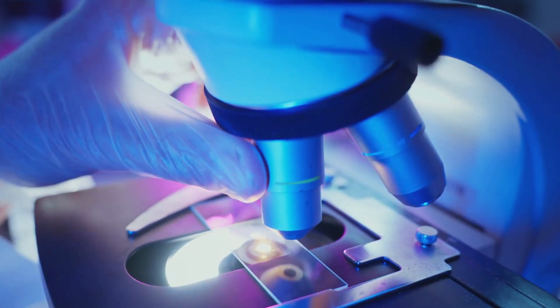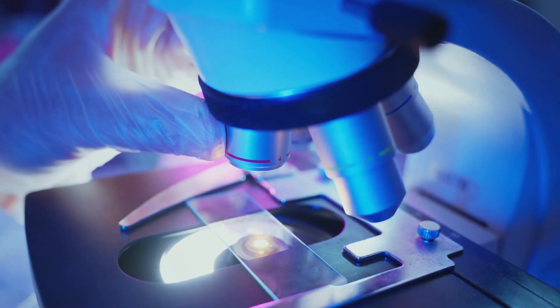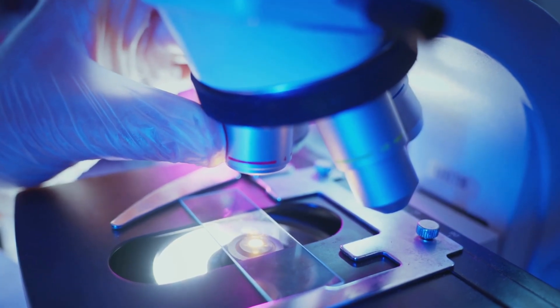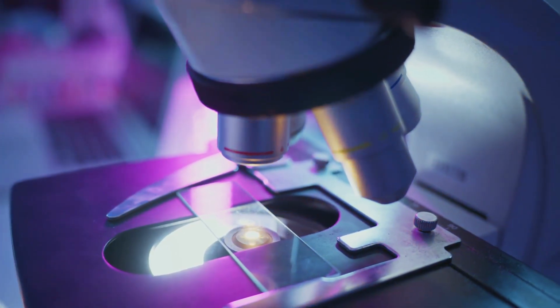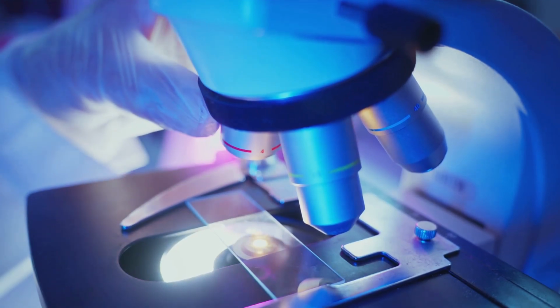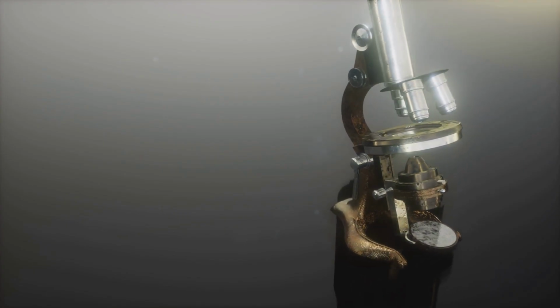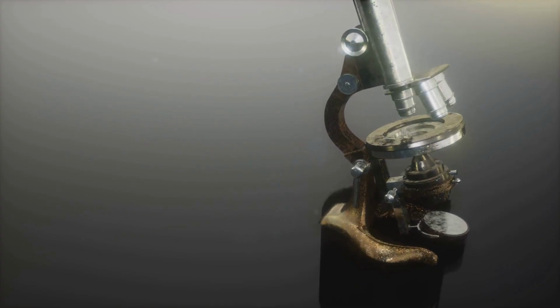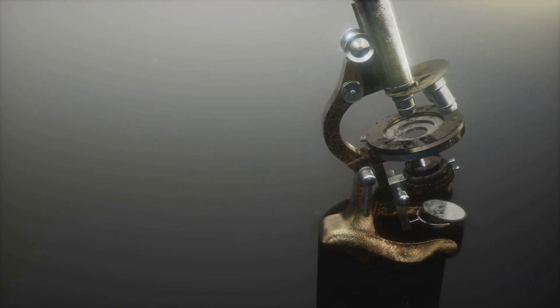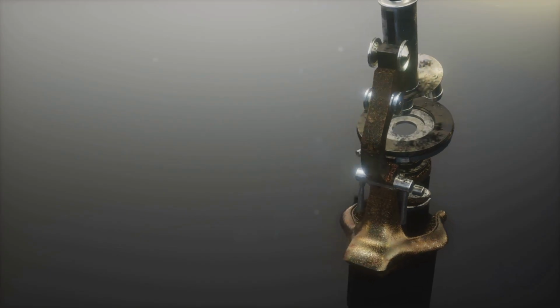In the end, light and electron microscopes are partners in discovery. Scientists often use both to get a complete picture. Use a light microscope to find an interesting event in a living cell. Then use an electron microscope to zoom in on the ultrafine structures, from Hooke's first glimpse of cells to the latest cryo-EM models of proteins. Microscopes have expanded the frontiers of human knowledge. By understanding what each tool does best, we can continue exploring the intricate, invisible world that surrounds and defines us.